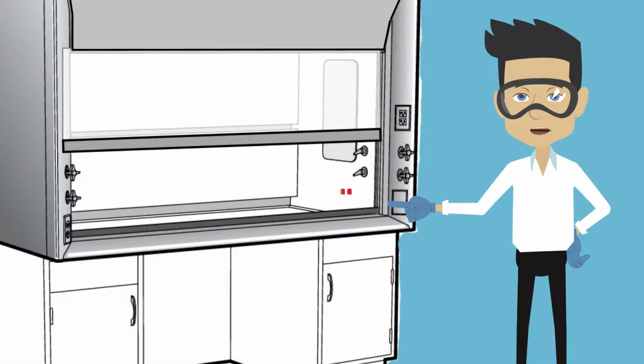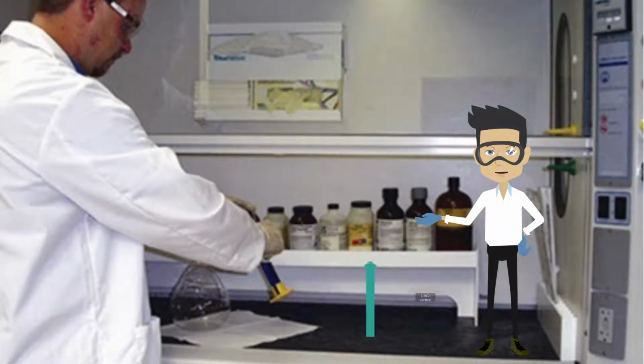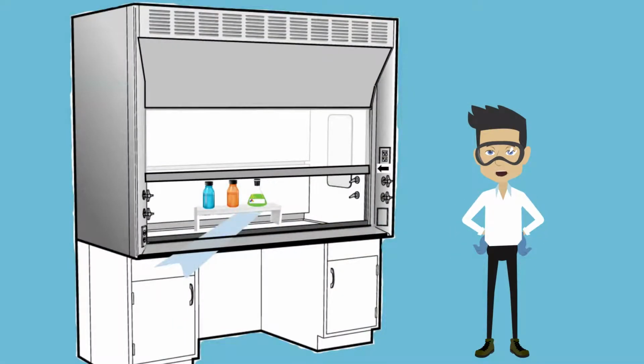All work should be done at least 6 inches into the recessed area behind the sill. This will help to keep materials from escaping the hood when there are air disturbances. Keep the fume hood clean and clear of unnecessary chemicals, glassware or equipment. Avoiding clutter will provide optimal containment by preventing turbulent currents. Use blocks or racks to elevate equipment 1 to 2 inches off the fume hood deck surface, so that air can easily flow around all apparatus with no disruption.